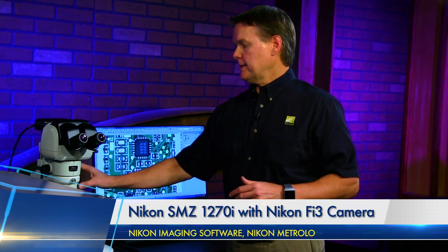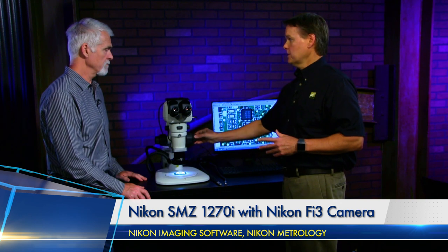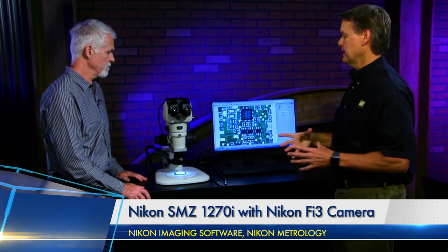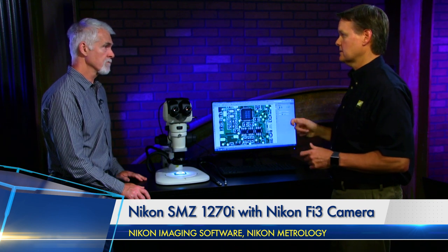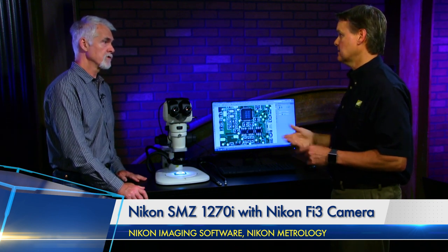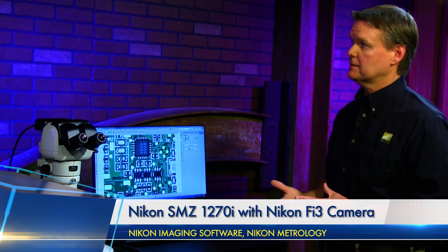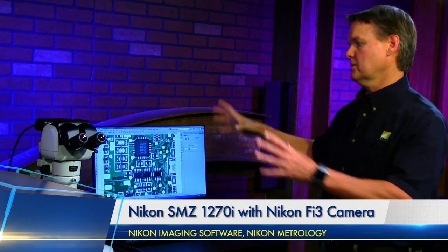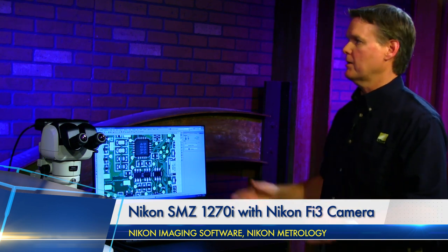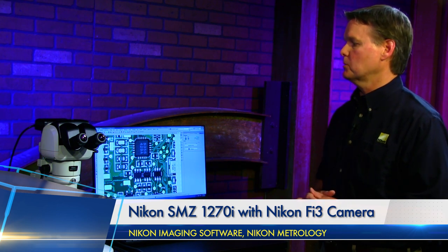This is what we call a standard upright stand—it has coarse and fine focus. We also have a stand with just coarse focus if you don't need fine focus at lower magnifications. We can also mount these on transmitted light stands. We have boom stands as well, for when you have large parts on a table and want to move them underneath the stereoscope. So those are three different stand options that we offer.